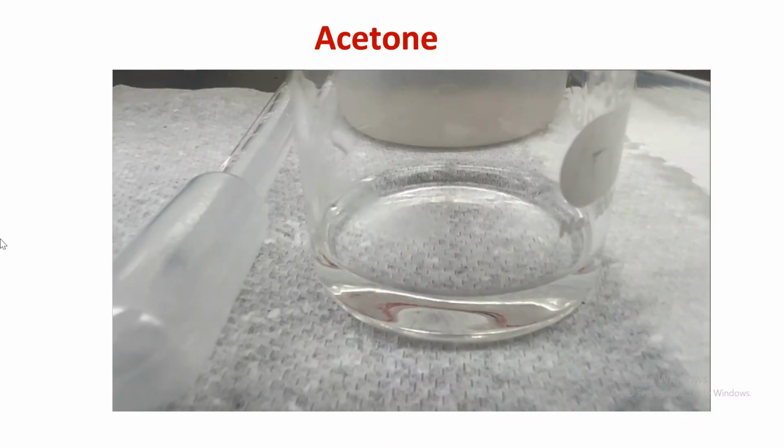We cannot distinguish the density. We cannot know for sure the density, which one is more dense and which one is less dense. Is it acetone or is it water? Because they mix. So you can write NA for your density observation, and then you're going to fill out table 3 accordingly.